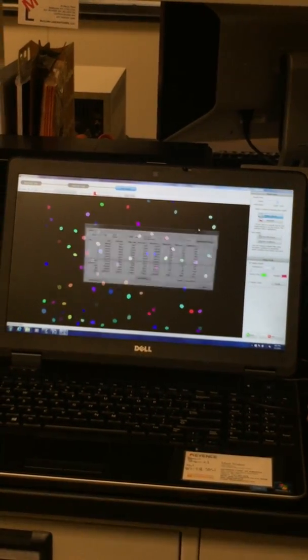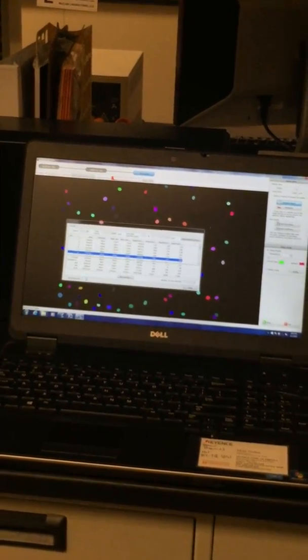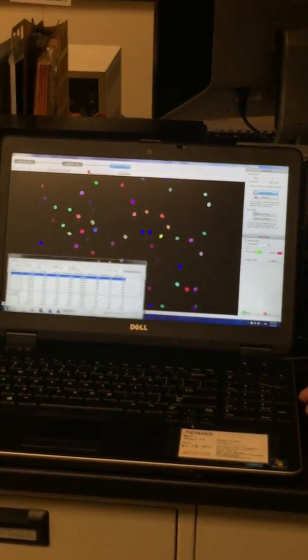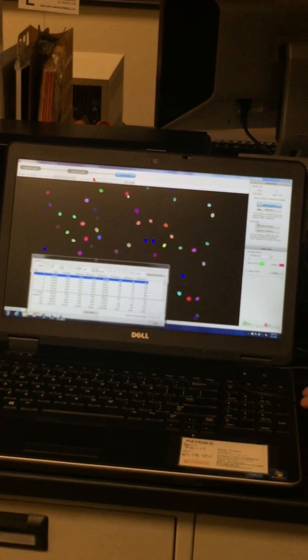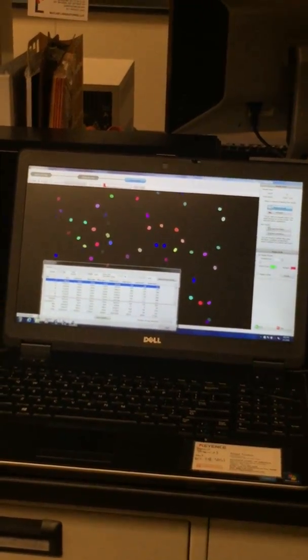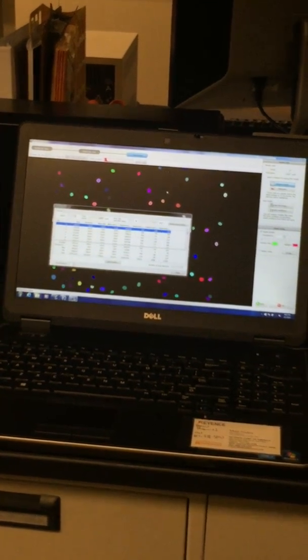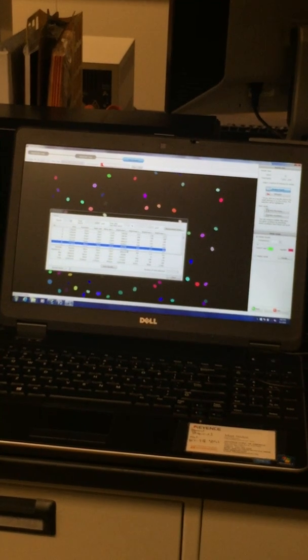If you go to measure result, let's say I'm curious about what the data is for this specific little nucleus here. If I click on it, it brings me right to it. Same way if I click here and I can find this one, because it's the highlight color. No, I lied, this is the highlight color, because it goes from top to bottom, so I know number 3 is somewhere near the top. So I'd recommend, if you're curious about the specific data per cell, nucleus, whatever it is, just click on it here and it'll bring you right to here.